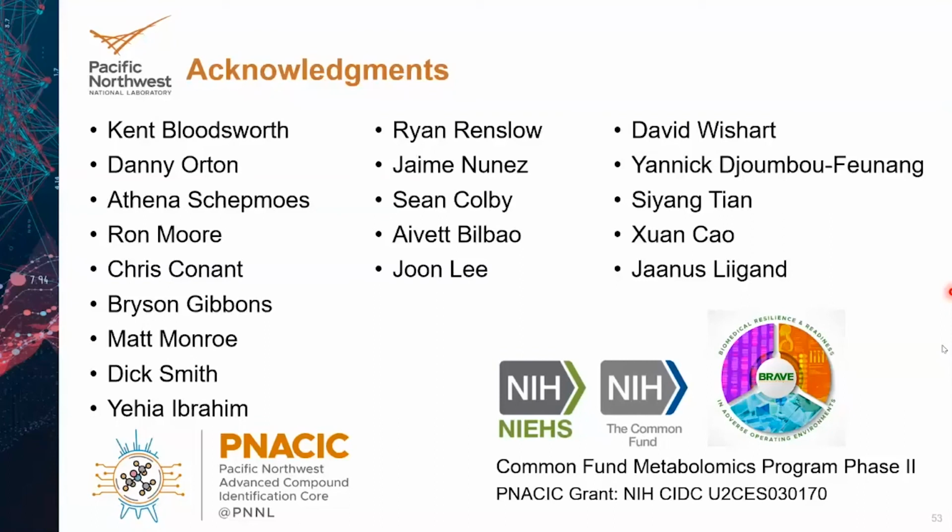So the plan is essentially to generate additional experimental CCS values from analyses of authentic compounds. We've got about 10,000 in-house. I'm not sure whether we need the data from all 10,000, but we certainly want to experimentally measure compounds that have diverse chemistries to make sure that we don't have bias one way or the other in either of the predictive platforms, and that's our plan.